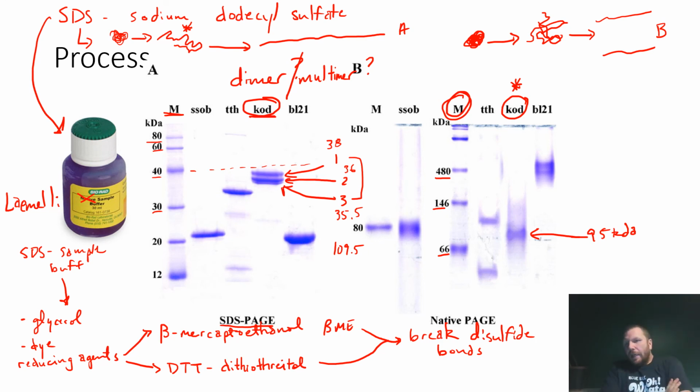Now, is that a reasonable number by comparison? Yeah, that is, because my structure right here was about 95 kilodaltons. These three combine to be about 109 kilodaltons. And it's a little high, but again, I need more resolution, and I'm dealing with a native PAGE there, so my numbers could be distorted a little bit.